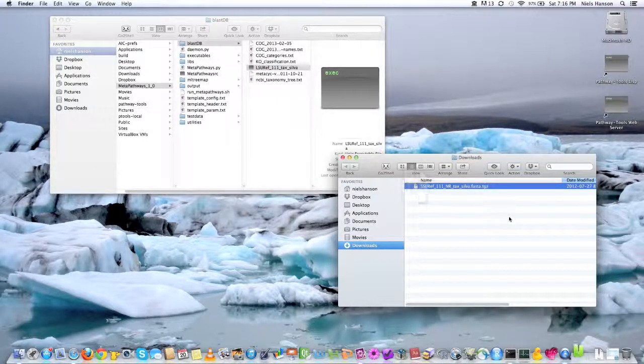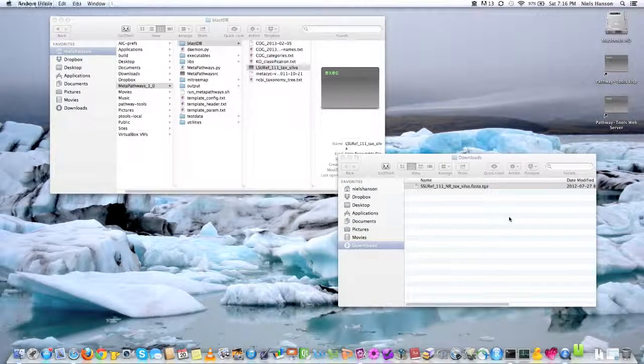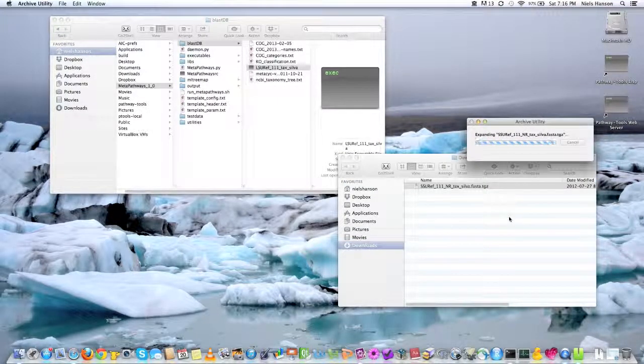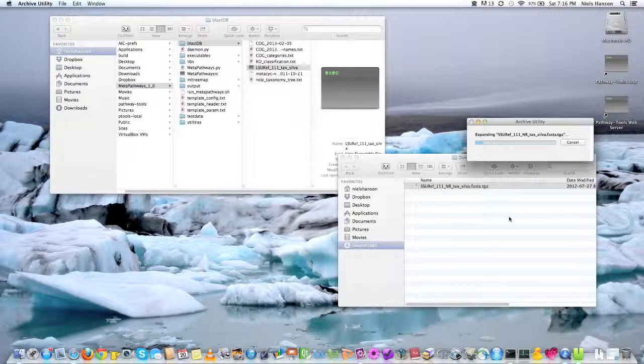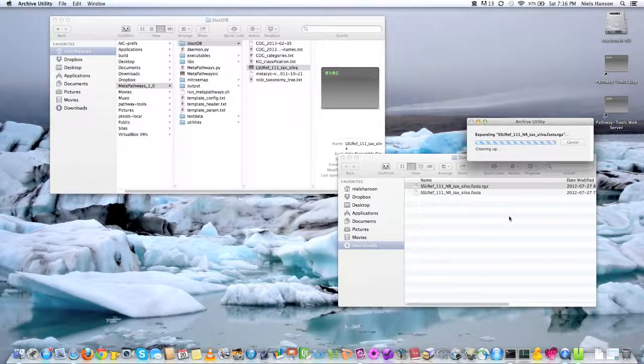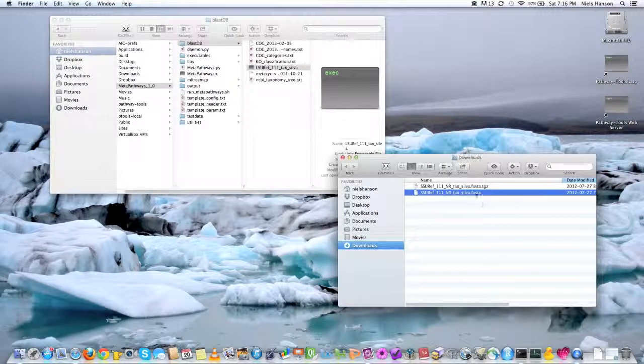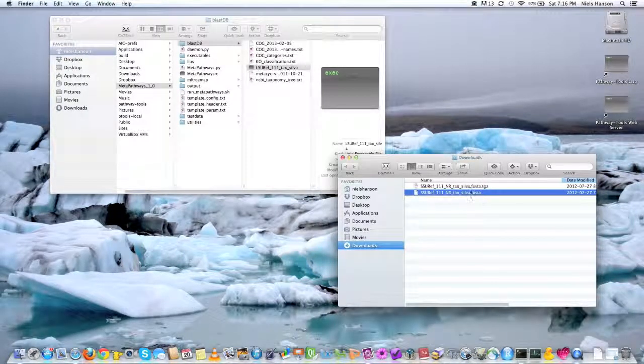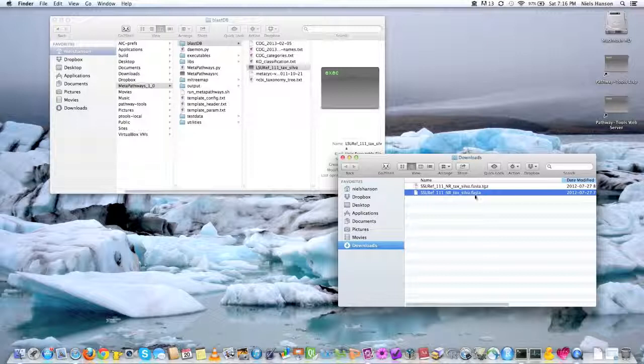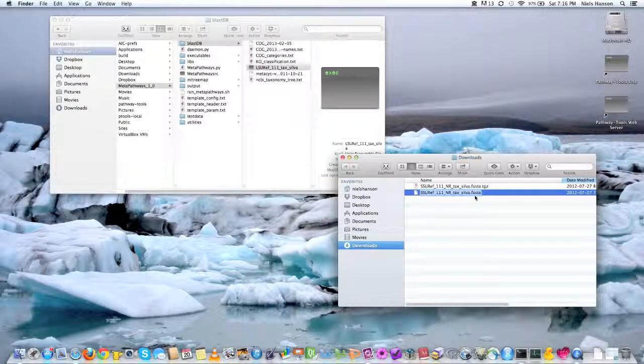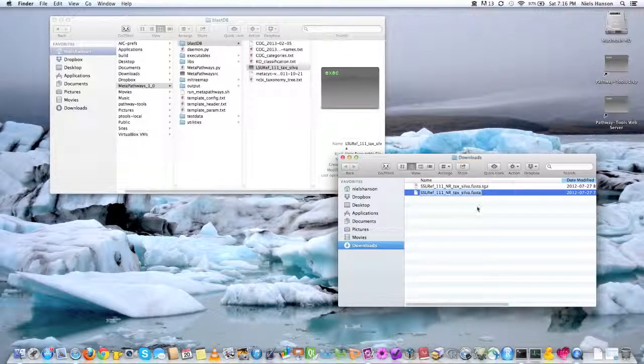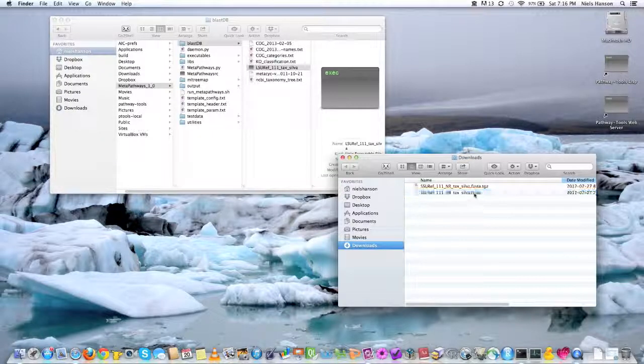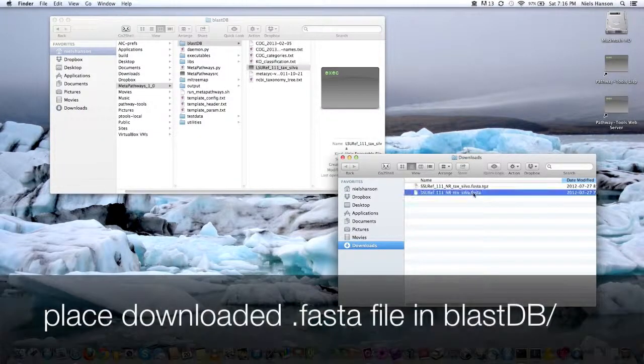So we'll wait while that happens. Sometimes it could take maybe a minute or so. And then once it's extracted, you'll just have this .fasta file without the tgz tar gzip ending to it.